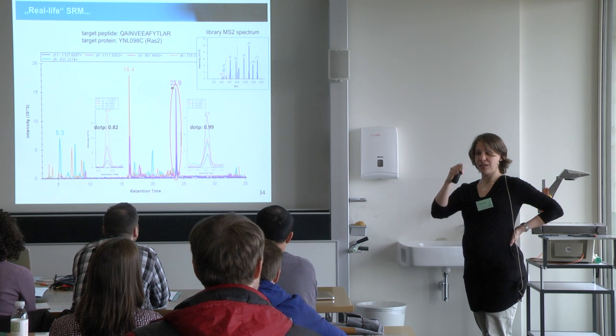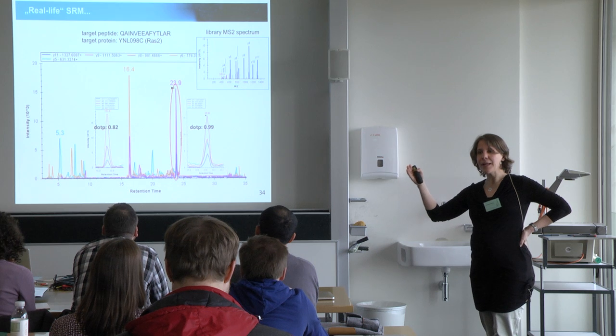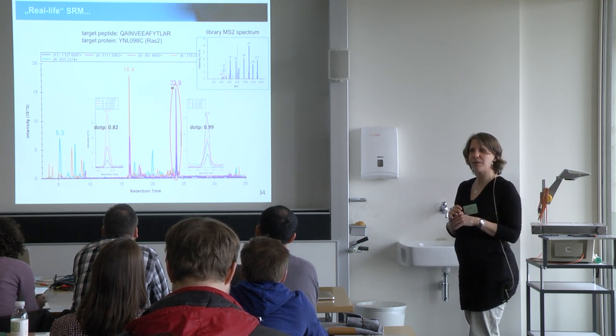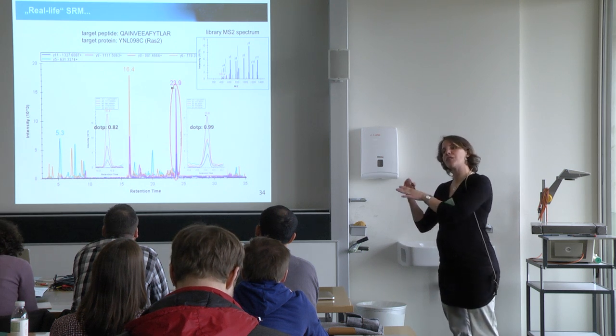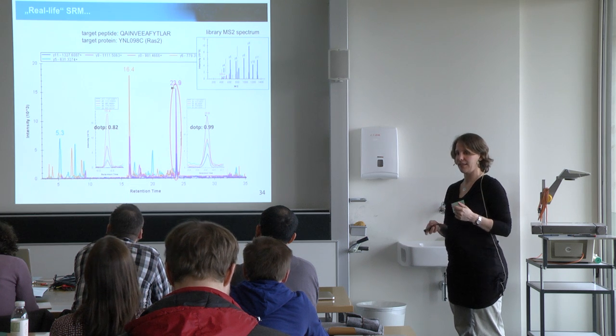But people will get convinced by, oh, look, I see coelution by three less selective transitions. And it also goes to what you said, that the higher molecular weight transitions are more selective, but they don't tend to be more intense. So the connection with intensity, I wouldn't say, but it's definitely true what Brendan said. They are more selective, so it's more likely to find those only in a single peptide than in many others.